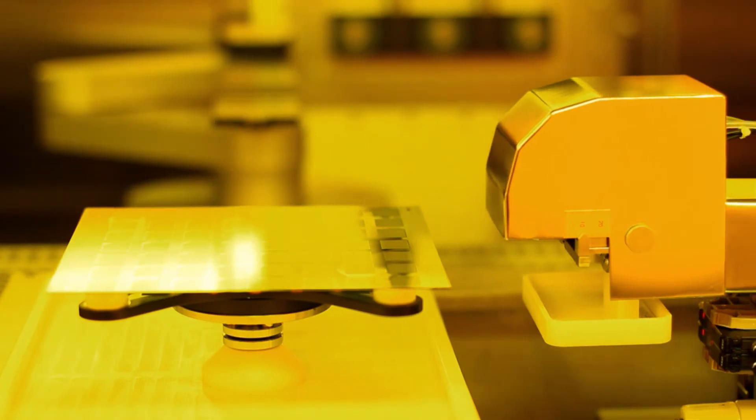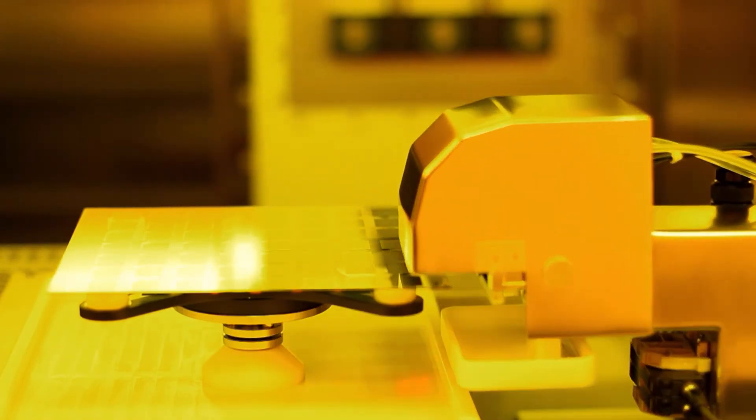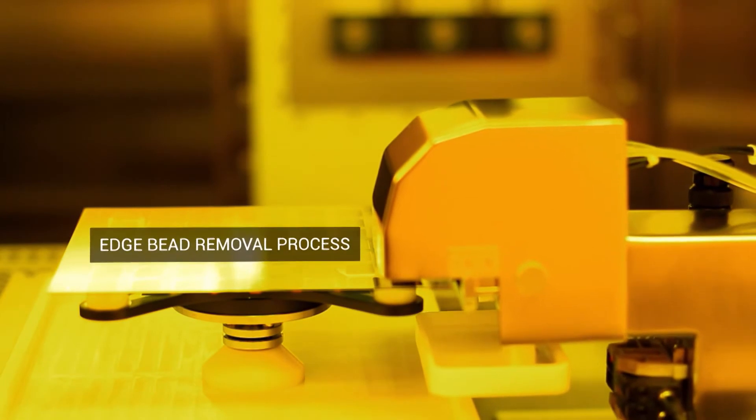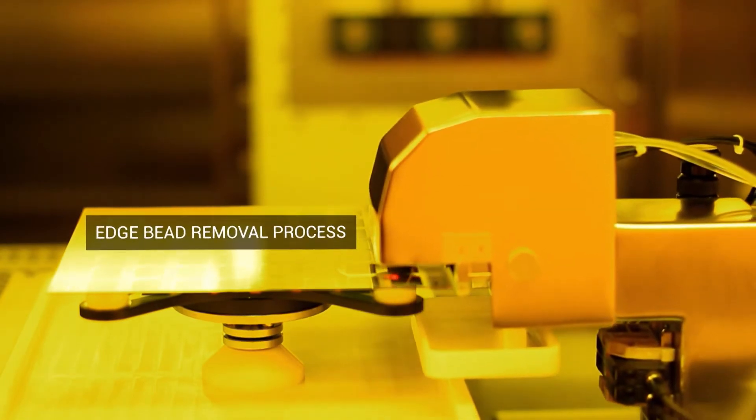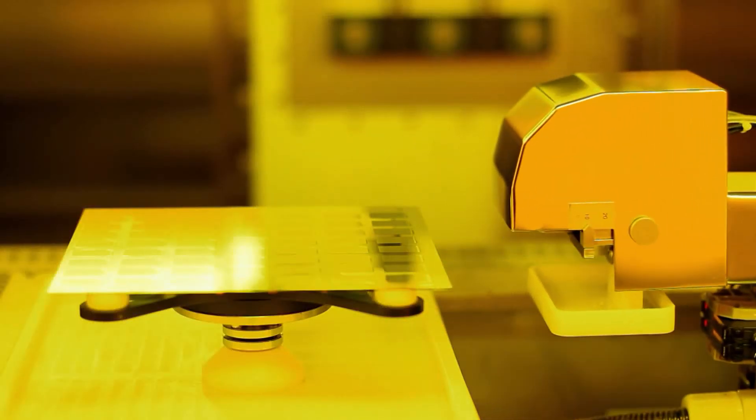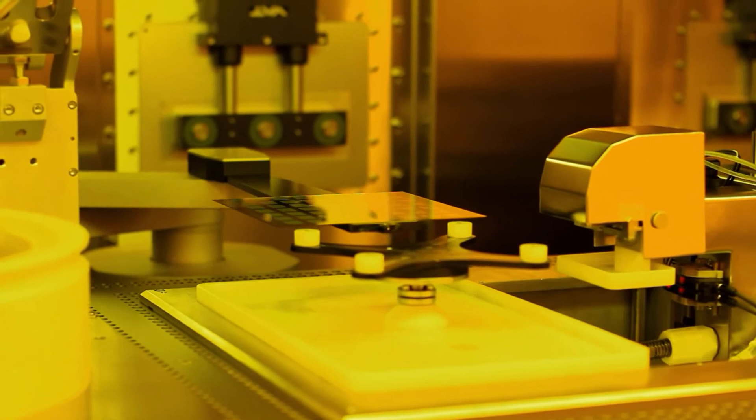Edge bead removal allows the edge coating to be removed over a predefined area, as specified by the device design. Precise positioning of the fluid nozzle controls the removal of both aqueous and solvent-based materials, maximizing the active area of the device.